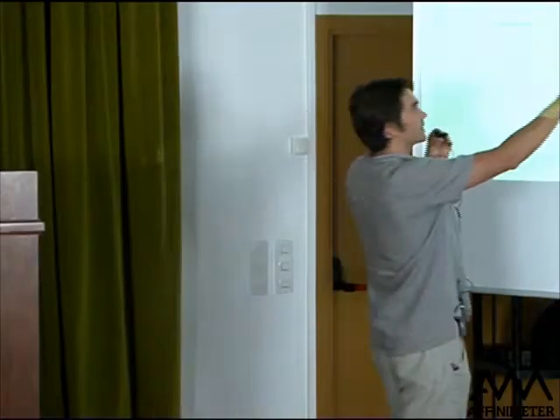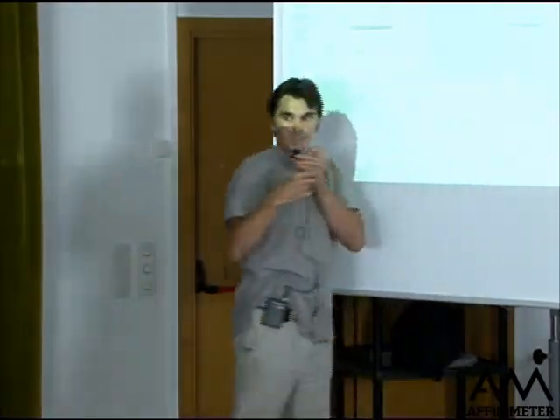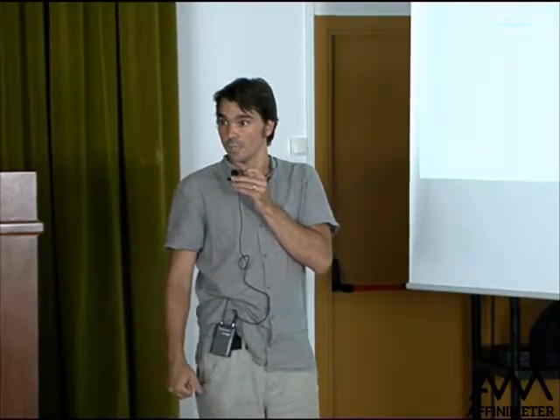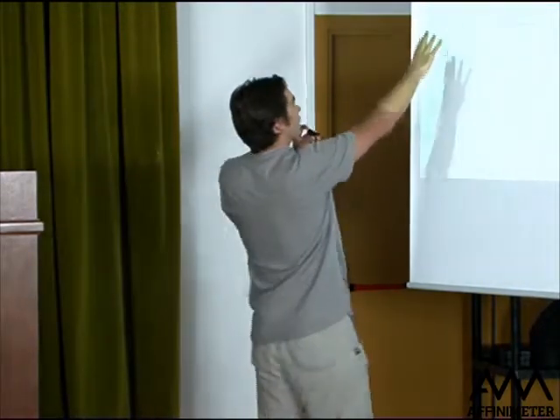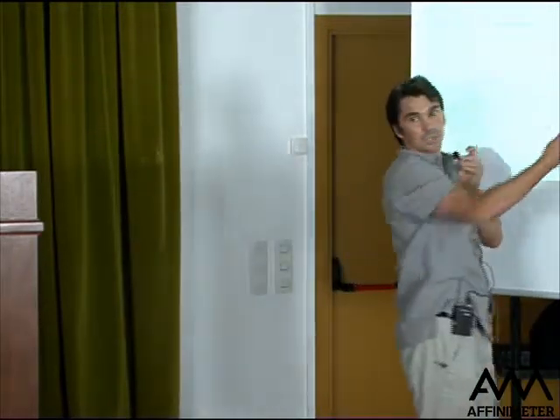In order to perform a displacement assay, you have to have one of them in the cell. And sometimes having both competitors in the syringe is much more interesting, you get more information from this. And the other problem is that you are losing some information. You have a very good measure of the delta H that you are losing in your analysis, right?